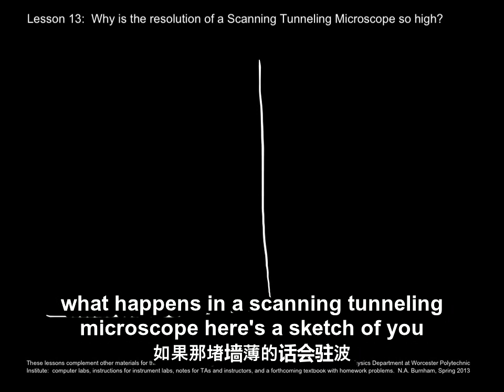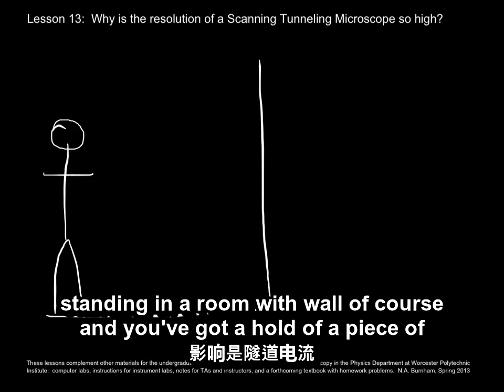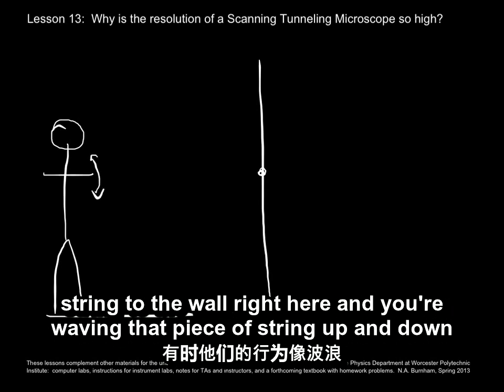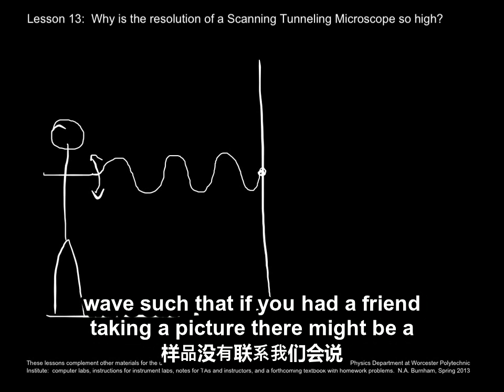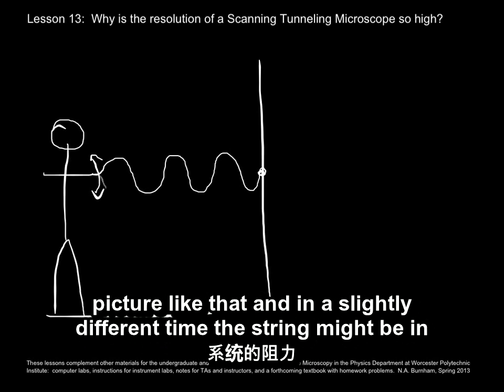Here's a sketch of you standing in a room with a wall, of course, and you've got a hold of a piece of string, and you've tied that piece of string to the wall right here, and you're waving that piece of string up and down, and it forms what's called a standing wave, such that if you had a friend taking a picture, there might be a picture like that, and at a slightly different time the string might be in this configuration.